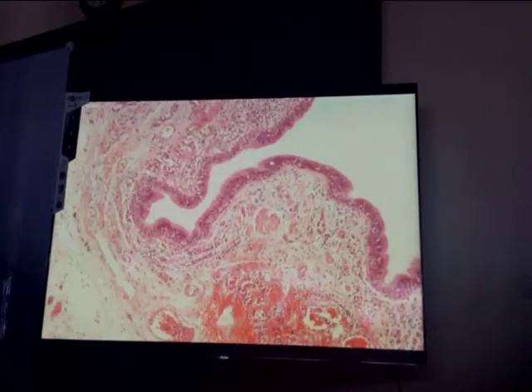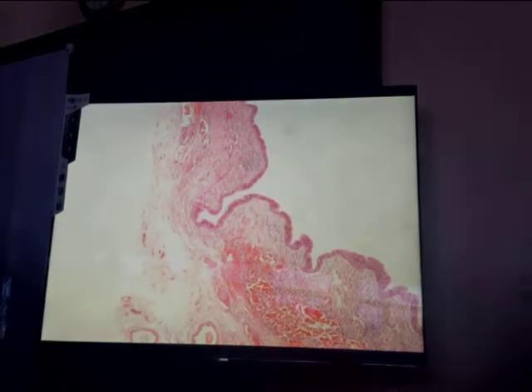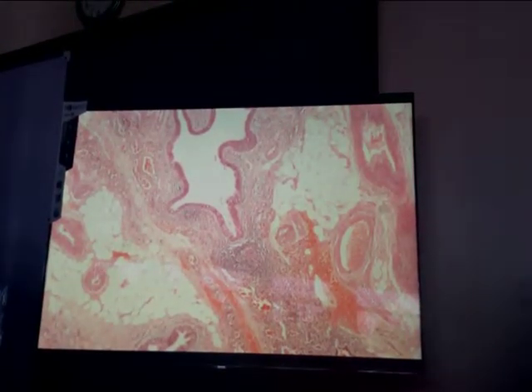Are you able to identify the epithelium pointed? Respiratory epithelium. Now, let us scan the circumference of that airway. Are you able to see any plate of hyaline cartilage? How about in that airway? Does it contain a plate of hyaline cartilage?